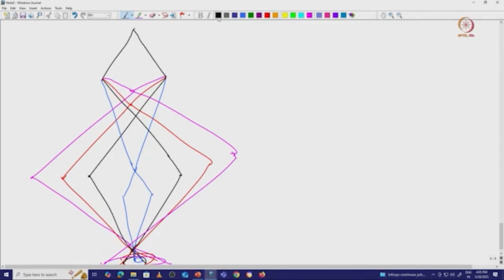If you remember, I told you an aperture is a metal disc with a hole in the center, and the rest is metal that covers it, so a ray can only go through the center. It is going to block the electron beam.